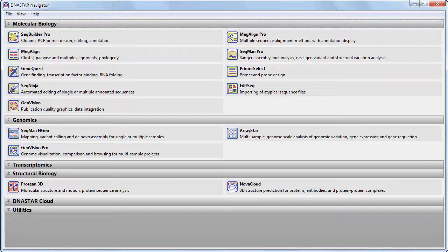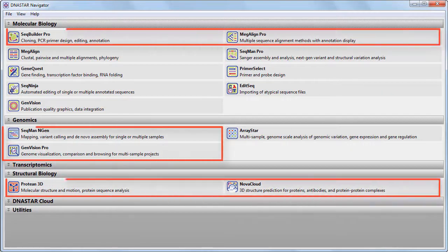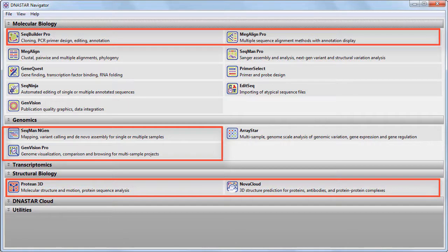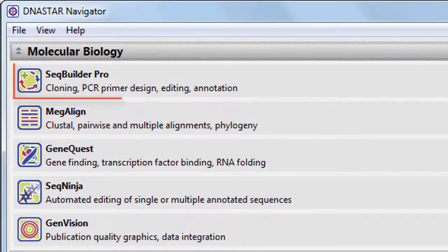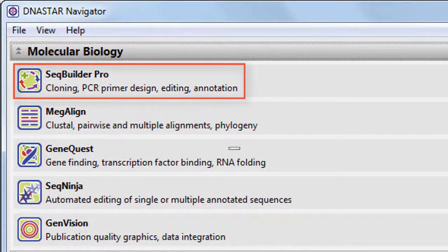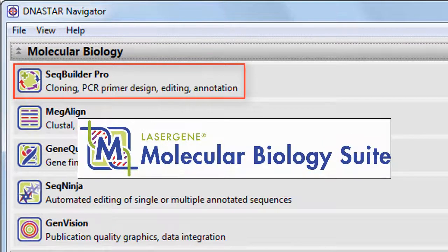In LaserGene 15, many of the DNA Star applications you rely on every day have new functionality and enhanced workflows. We'll start this brief video tour with SeqBuilder, the foundation of our molecular biology suite.